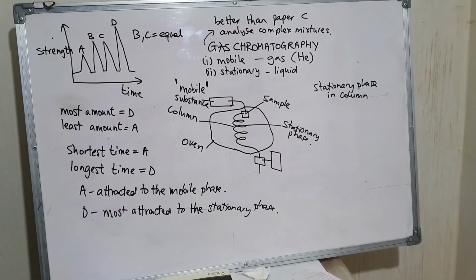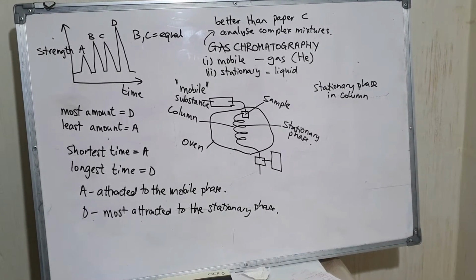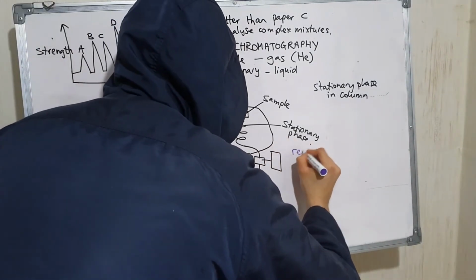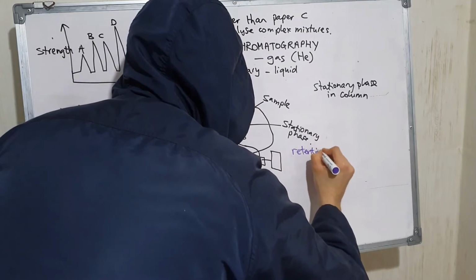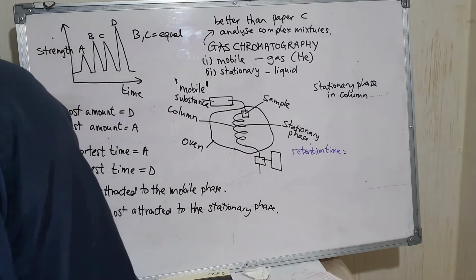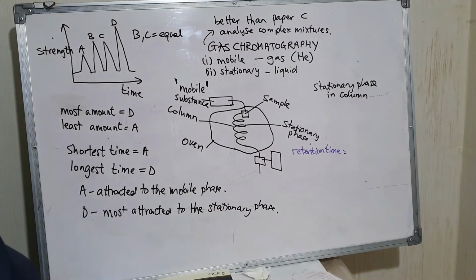And just a few more key terminologies that we can talk about. So what is retention time? Retention time is how long it spends in there.